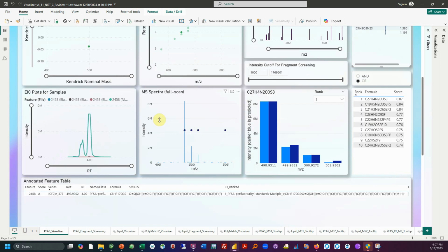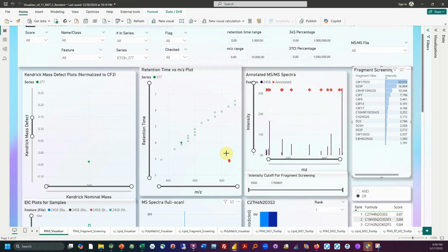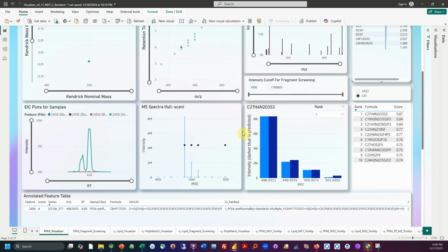Also, so this is the fragmentation plots. There is this MS1 spectra plot. It is very important to use this MS1 spectra plot to determine whether you have a pure spectrum. So if we highlight in on the precursor, you can see that there is no other peaks for this precursor. No major ones, at least. There might be some tiny ones in the noise, but nothing of similar abundance to this molecule, which means that this is a pure spectra.